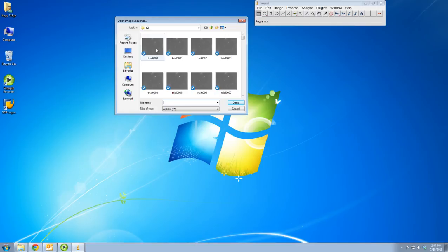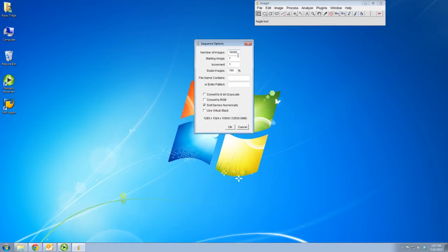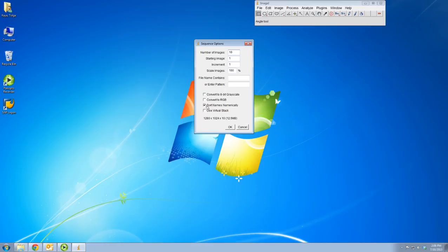I'm going to select one picture and say Open. It asks me number of images, starting image, and increment. Those are the three numbers I'm going to use. Number of images is how many images I really want to import — let's say I'm going to import only 10 images. Starting image 1 means it will start from the first image in that folder. If you see here, sort names numerically — that will help you.